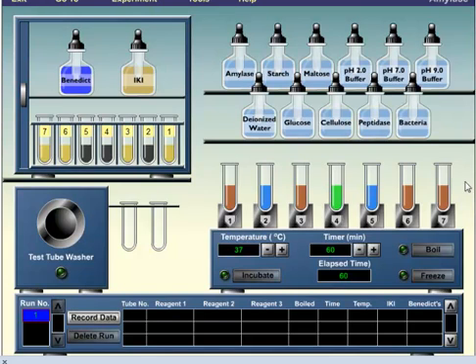Looking at this one, is there glucose? What about this one? Without question, we know tube number seven, six, three, and one contains glucose. Now tube number four is not glucose, but tube number four contains some glucose because of that greenish color.